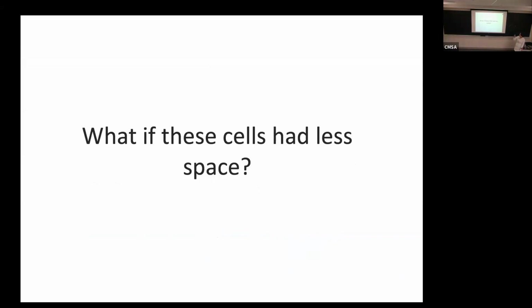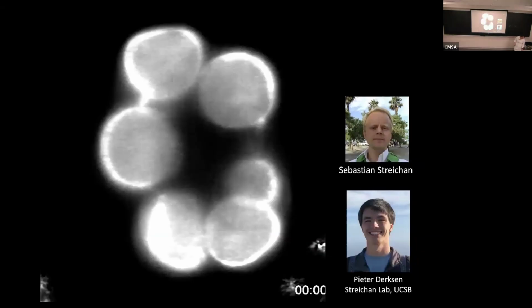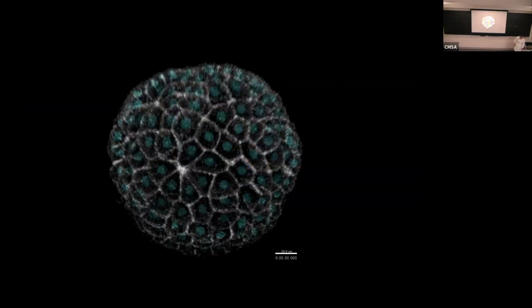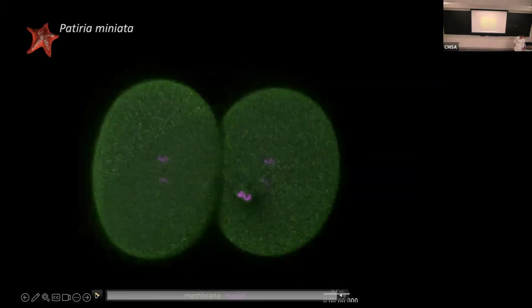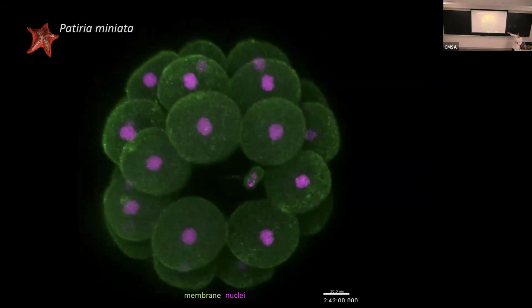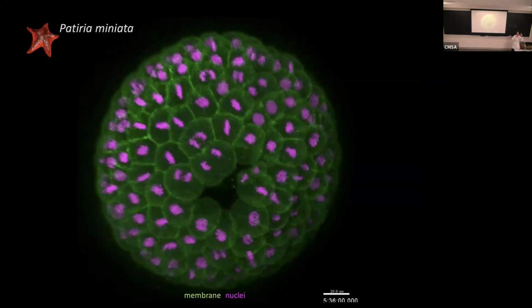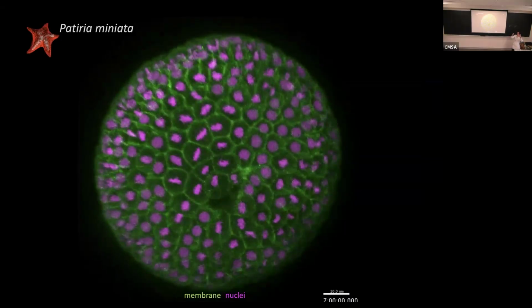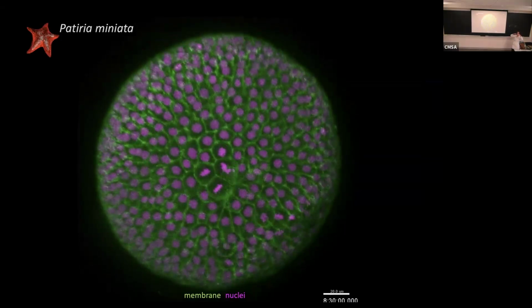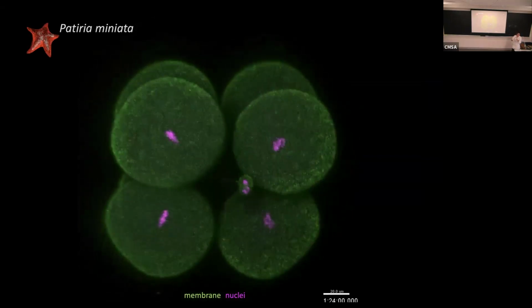And so basically what seems to be, that jump, like a sign of synchronized division. Yeah, so let me see, where's the earliest movie that I have of this? Here, right? So we have looked at this here, and basically every time that there is a cell division, the size of these openings are kind of jumping, because what's happening is that, because of the oriented cell division, the cells pop next to each other. So you are thinning the tissue and spreading it, right? And it seems that at every round of cell division, there is a jump, right?